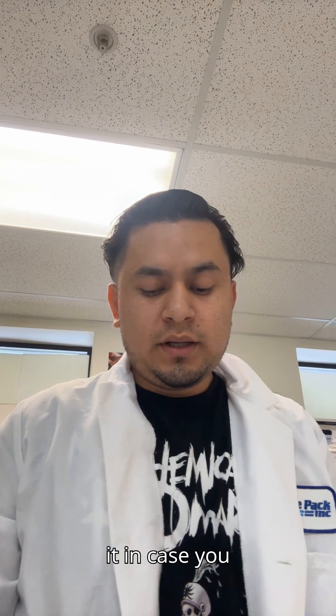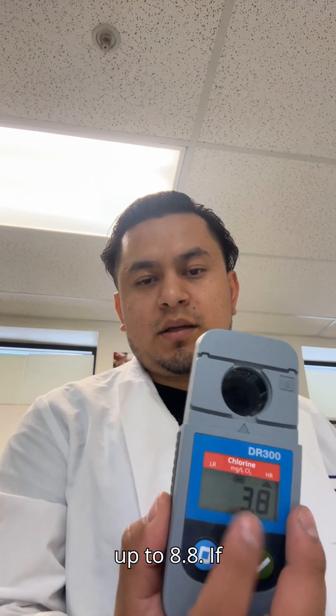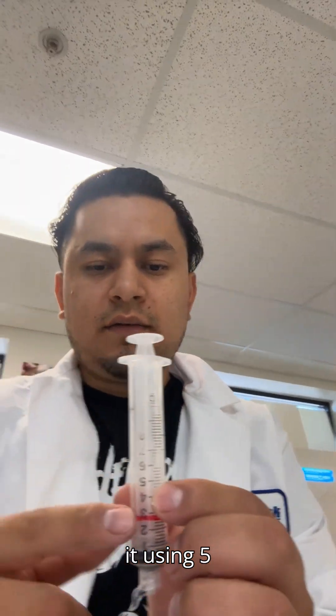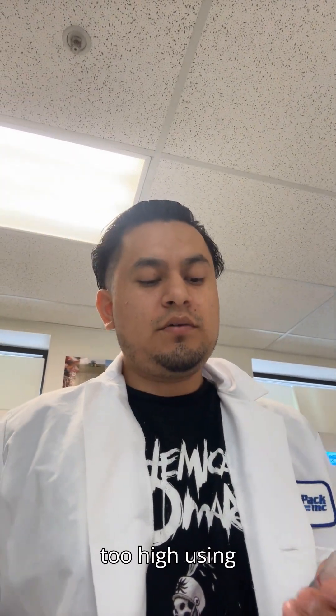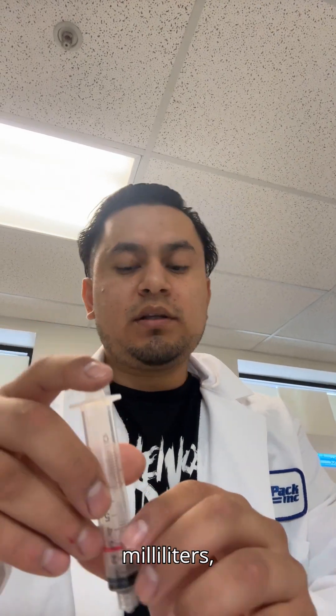So I just rinsed it off, and I'm going to show you how to dilute it in case you get an error screen. This machine will only test up to 8.8. If it's any higher than 8.8, you'll have to dilute it using five milliliters of the chlorine sample and five milliliters of just water. If it's still too high using that half-and-half, there's a line here for two and a half milliliters, so we're going to try that.